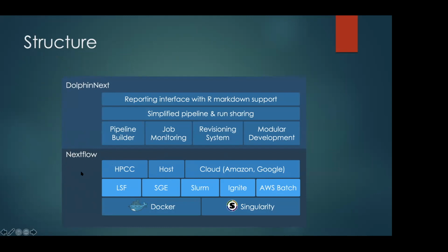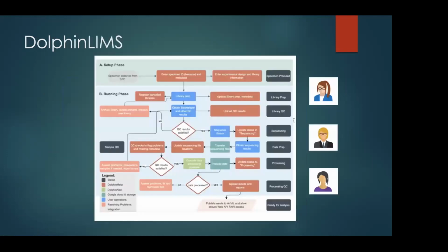And because this is kind of hard, there's a huge learning curve to write in Nextflow. But with DolphinNext, there is still a learning curve, but in a couple of hours you can actually understand what's going on here and run your own pipelines yourself. Today, hopefully, you will learn how to create your own pipelines yourself using DolphinNext.